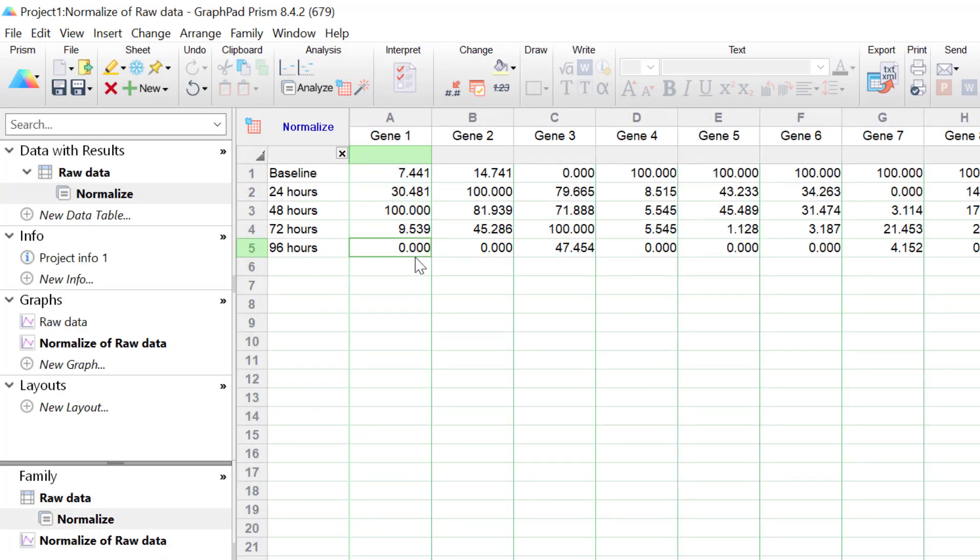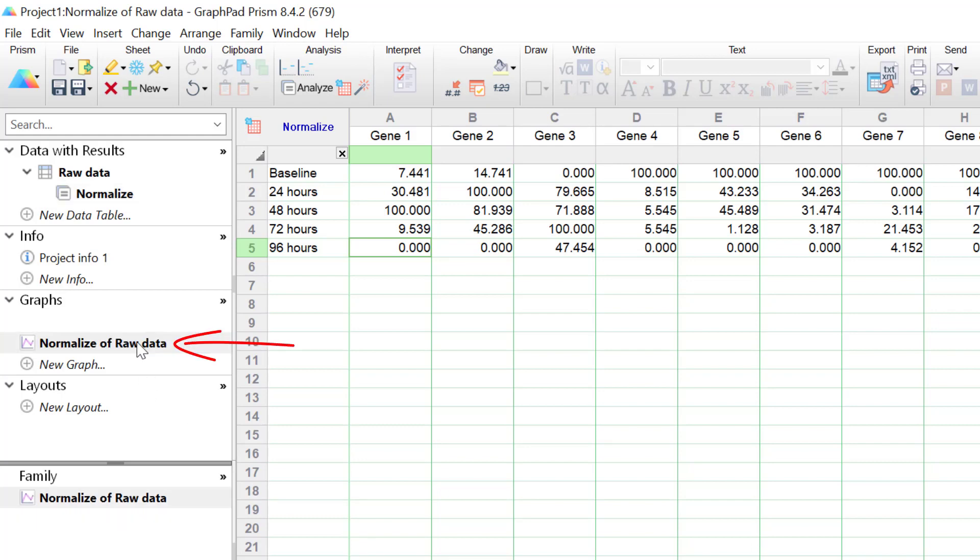The cells with gene expression values between these two values will then have a value between 0 and 100%. And this normalisation process is then repeated for each gene separately. So let's now create a heatmap using this normalised data by clicking on the new graph sheet that has been created.